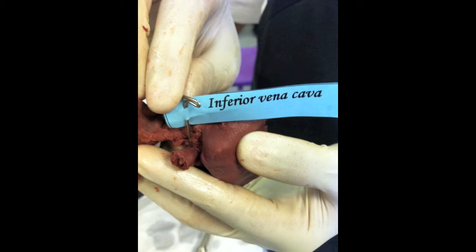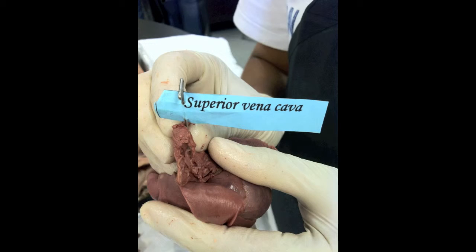The inferior vena cava carries deoxygenated blood to the heart from the lower half of the body. The superior vena cava carries deoxygenated blood to the heart from the upper half of the body.